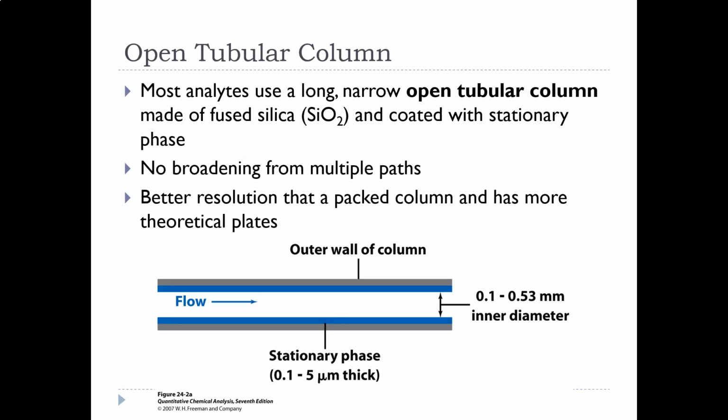When we're dealing with open tubular columns, we have to have a low concentration of chemical. Like the solute. And the pressure is going to be important.